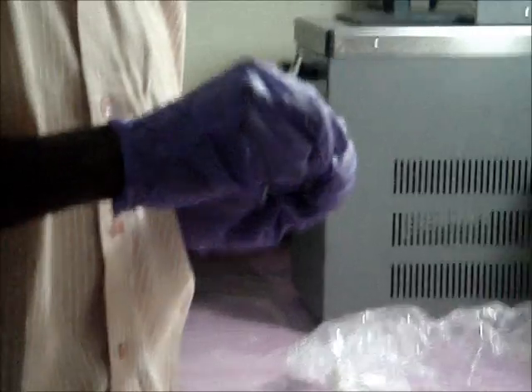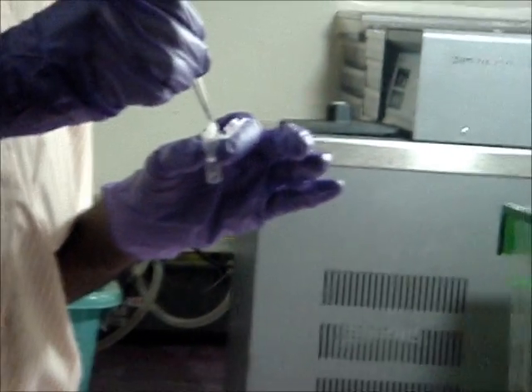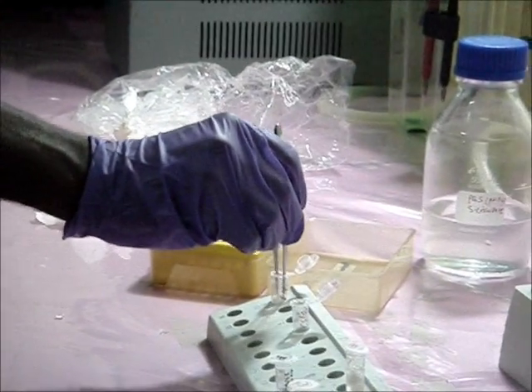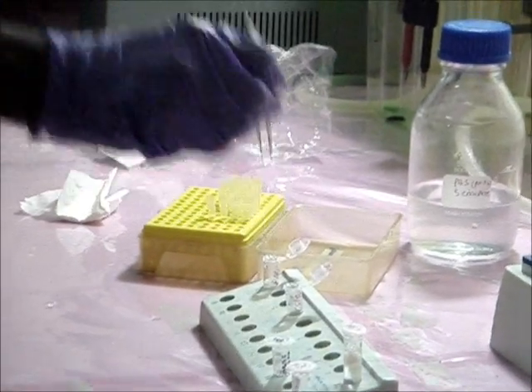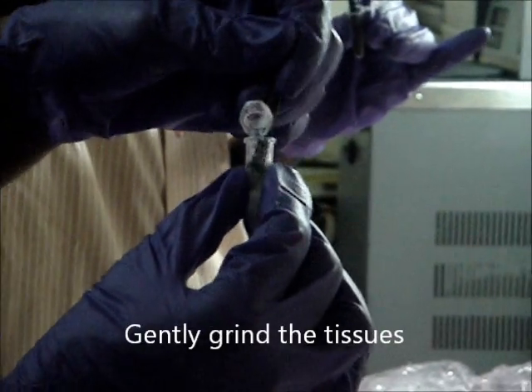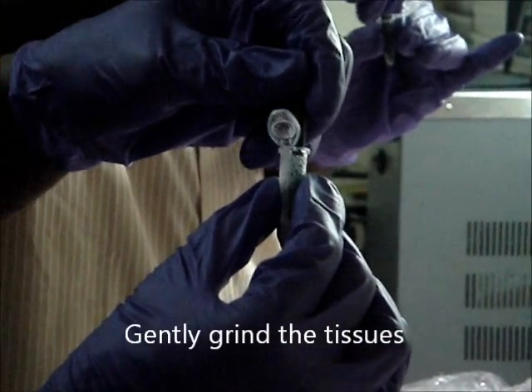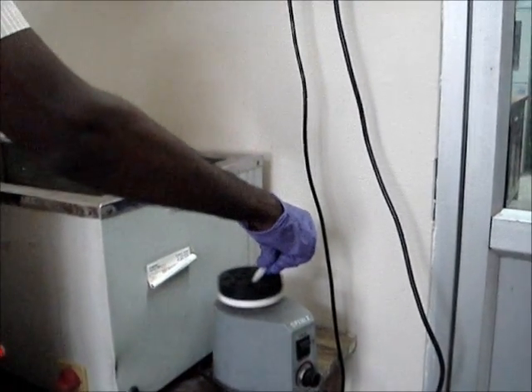Thaw the lysis buffer before use. Transfer the tissues to 250 microliters of the lysis buffer. Grind the tissues in lysis buffer. Vortex the mixture for 5 minutes.